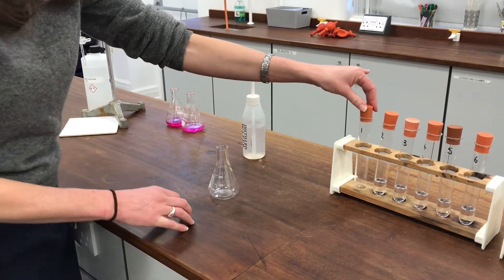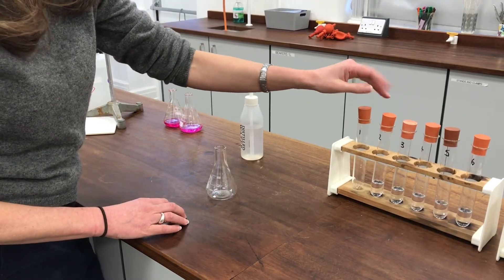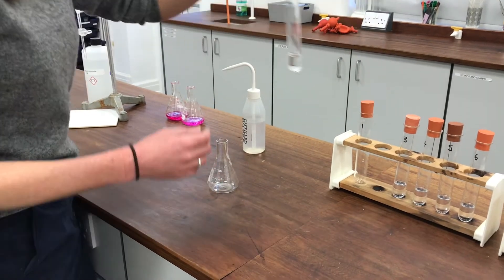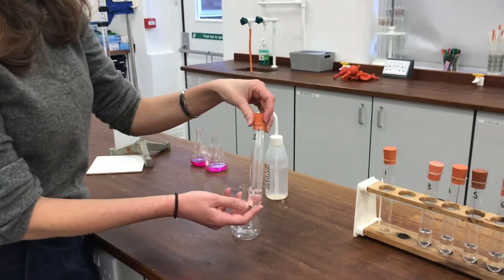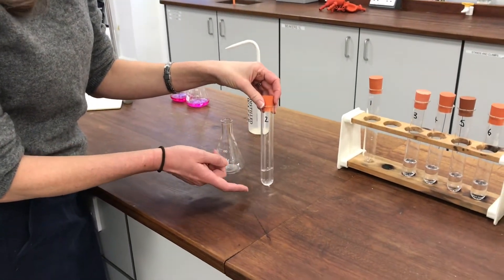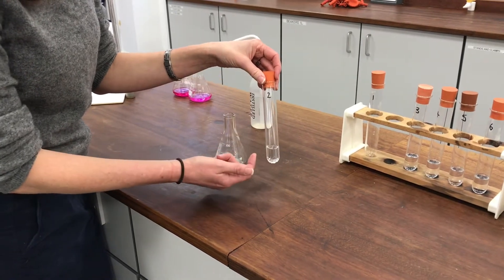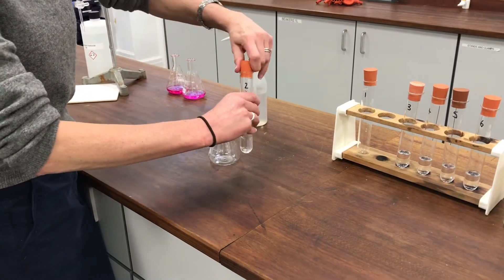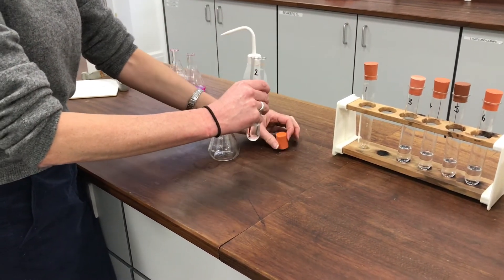I've filled up my burette ready for the second one now and I'm going to show you how to do it. Because the volume of sodium hydroxide that needs to be added is quite large and the boiling tube isn't an ideal shape for mixing, I'm going to transfer the solution from the boiling tube into a conical flask because that allows me to swirl the mixture better.